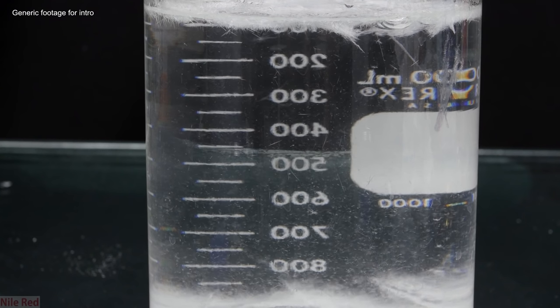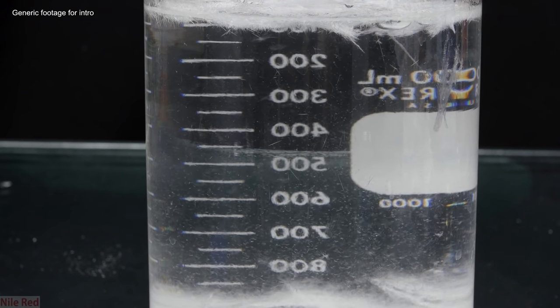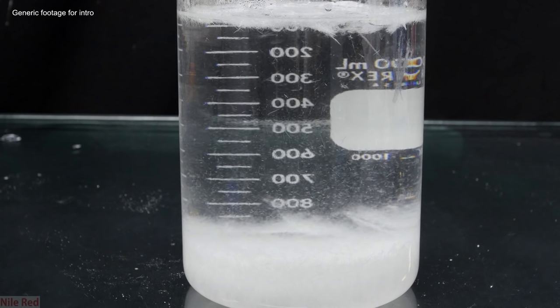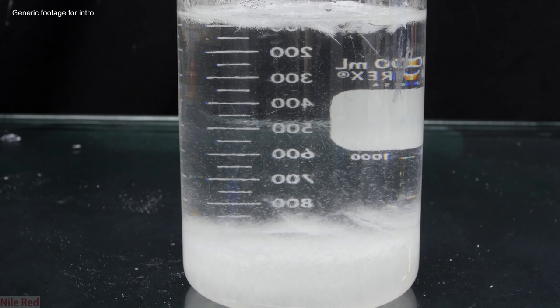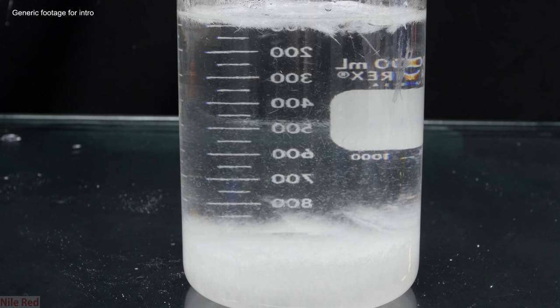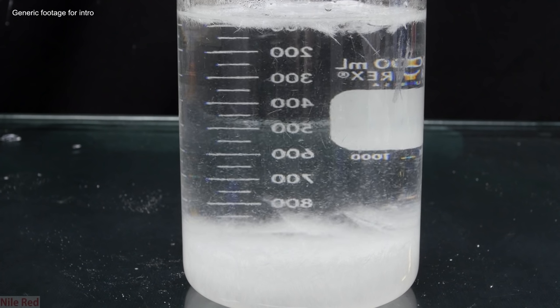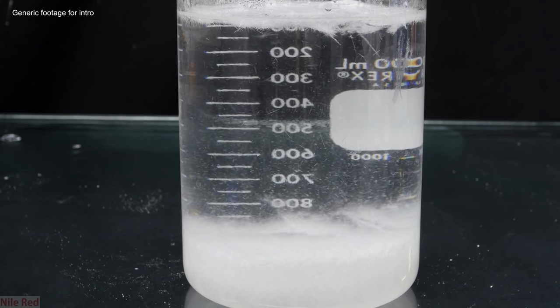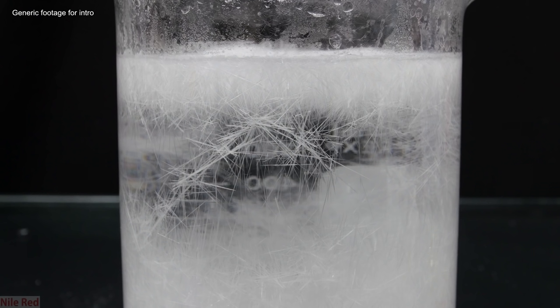What is done is basically just as the technique says, and the solution is filtered while hot. Because we need to keep everything super hot, the apparatus that we filter it through also has to be warmed up. I won't get into all the details now, but basically we pass the hot solvent through a filter, which collects all the impurities. Then our clean solvent, free of insoluble impurities, is collected and allowed to recrystallize as normal.